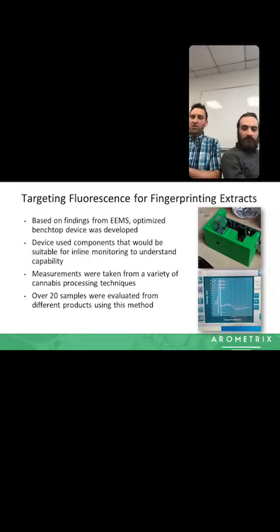So the prototype you see in the top right is the benchtop system that Kenneth was saying he takes out. We took this system out to one of our partners. We measured over 20 different samples. They were everything from extracts, distillates, different processing conditions, different qualities, and we just ran everything that we could see with the HPLC results to cross-validate with.